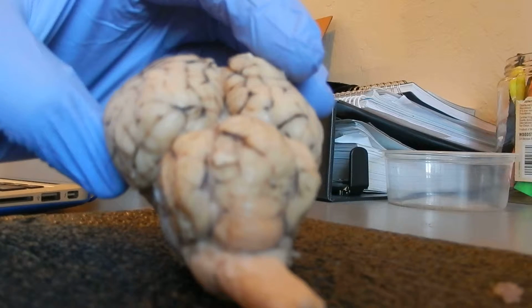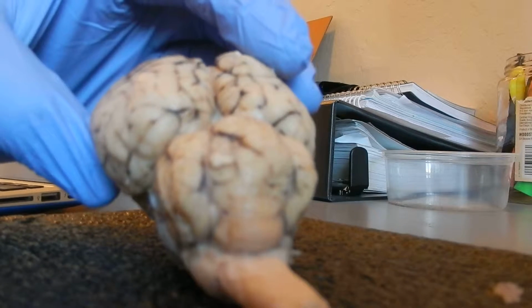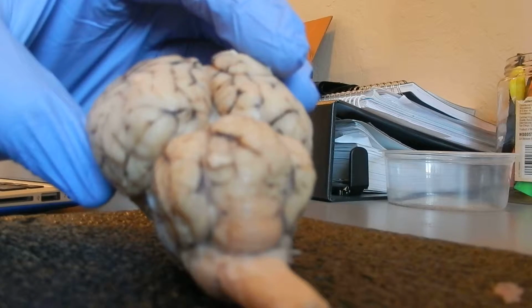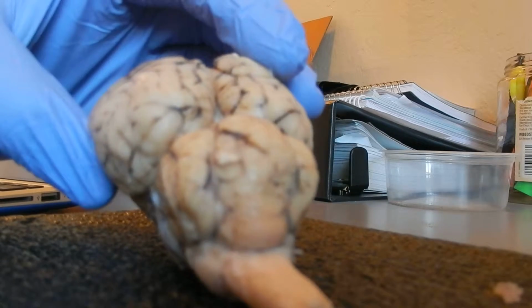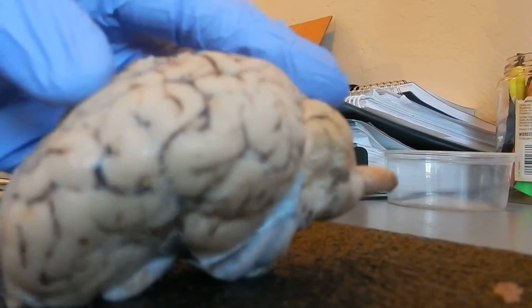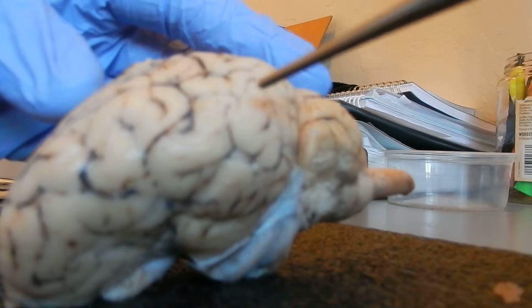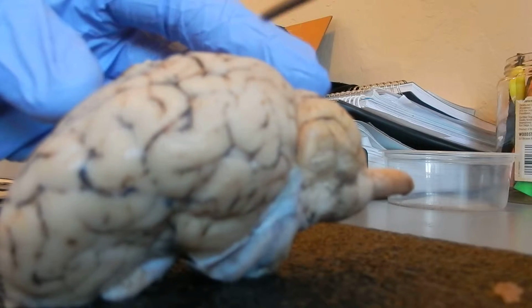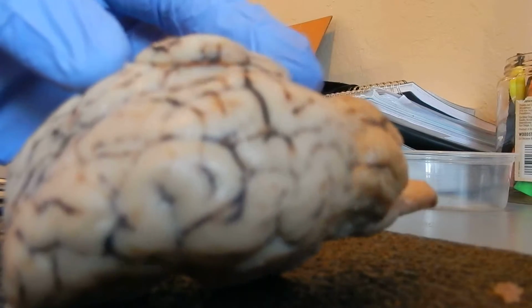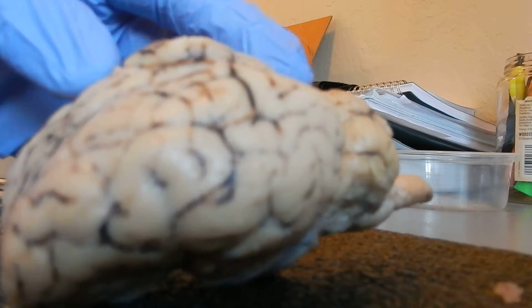The next part of what we're going to be talking about for the brain is we're going to find the gyrus and the sulcus. For example, here you would find a postcentral gyrus, and here you would find a central sulcus.